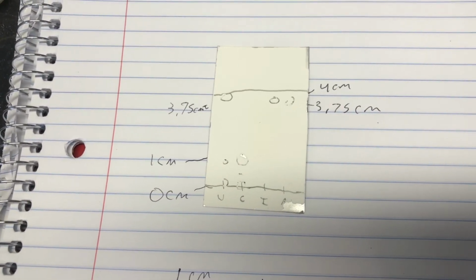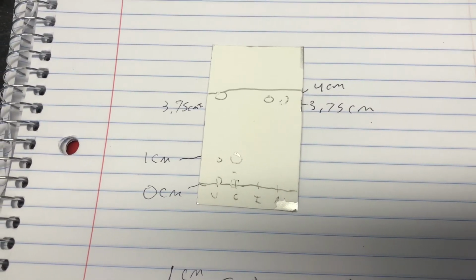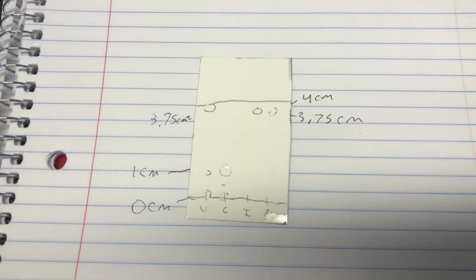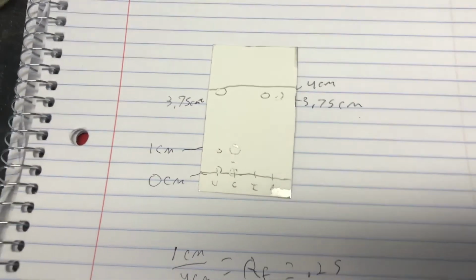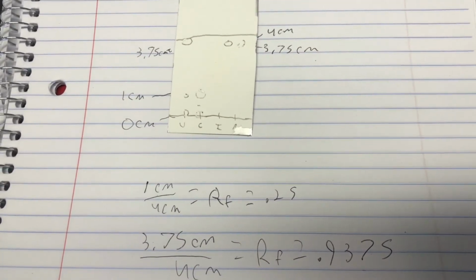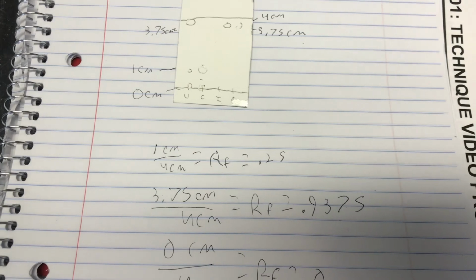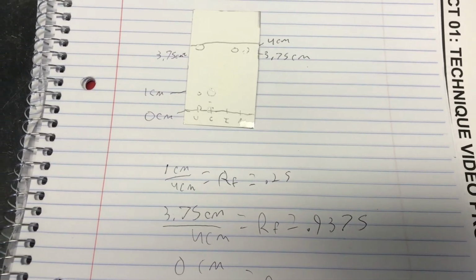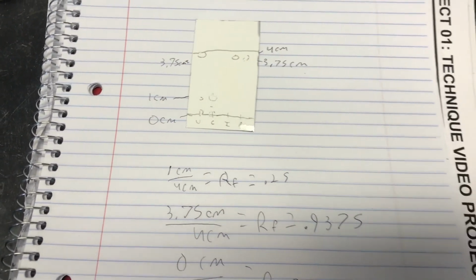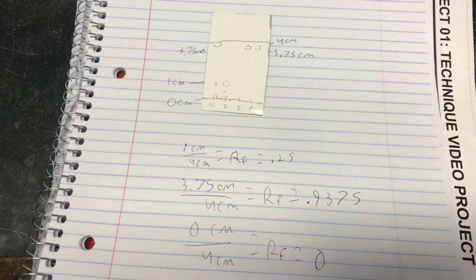But yeah, this is definitely why you should double check what eluents actually work, because this was an eluent I used a long time ago in a previous lab, and we ended up just assuming that it was going to work again. But you really should check beforehand to see if you do get the proper separation that you're looking for with what you're using. So that's one thing. It's good to learn from mistakes.